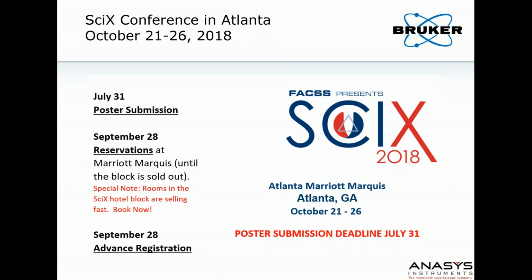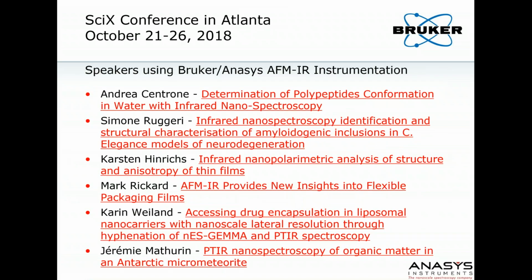And there's a whole series of talks at that conference. These are all speakers that are speaking in sessions that I'm going to be chairing. Some of the work I've already talked about a bit. Andrea Centroni will be talking about peptide conformations in water. Simone Ruggieri will be talking about identification of structural characteristics and inclusions in neurodegeneration examples. Karsten Hinrich, who just did the polarized result, will give an overview talk on how to use AFM-IR to do anisotropy of thin films.